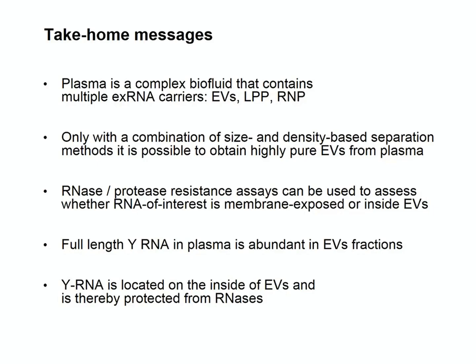To summarize, we have shown that plasma is a complex biofluid that contains multiple extracellular RNA carriers. We have also shown that a combination of size and density-based methods applied sequentially are needed to obtain a pure EV population from plasma. In addition to these techniques, RNase and protease resistance assays can be used to assess whether an RNA is exposed or inside of EVs. To answer our research question, Y-RNA is present in EV fractions in plasma and is located within the lumen of the EV. Thank you for your attention.